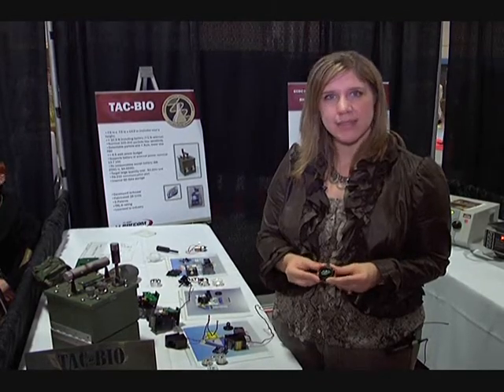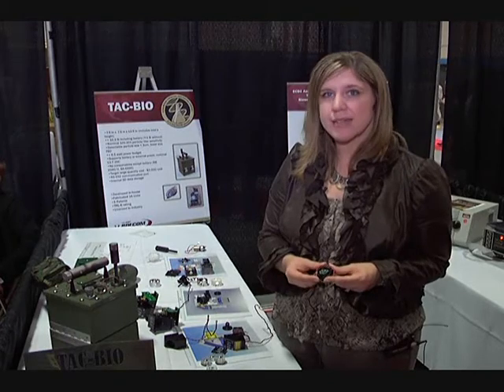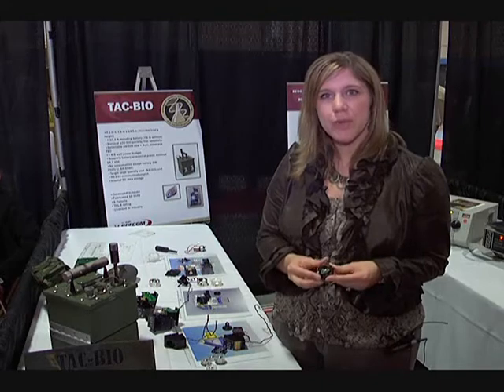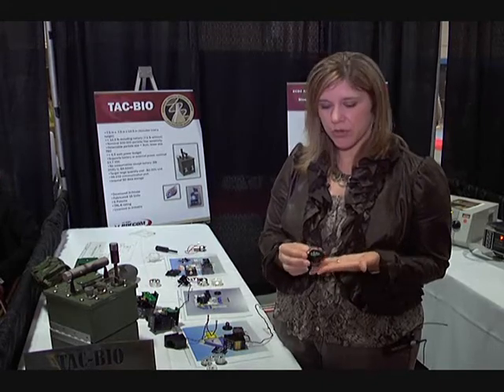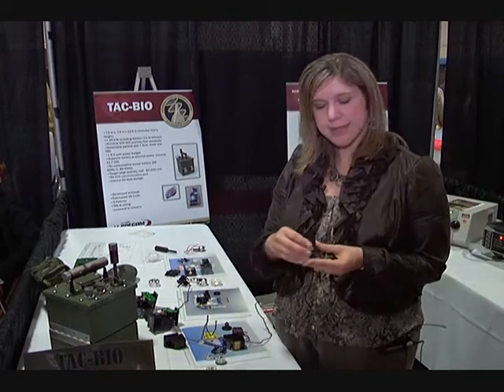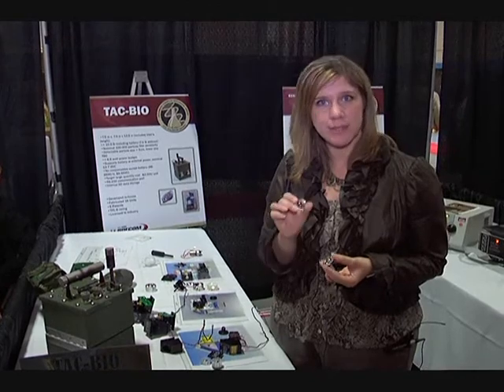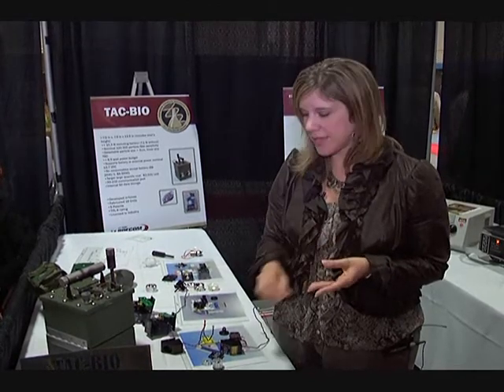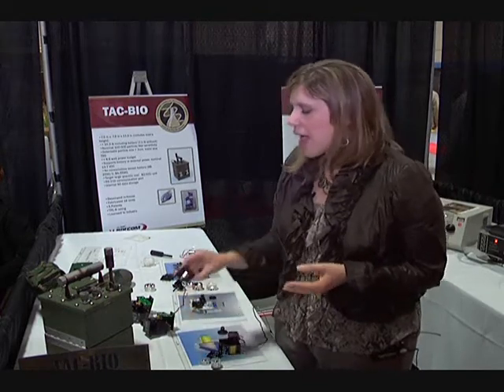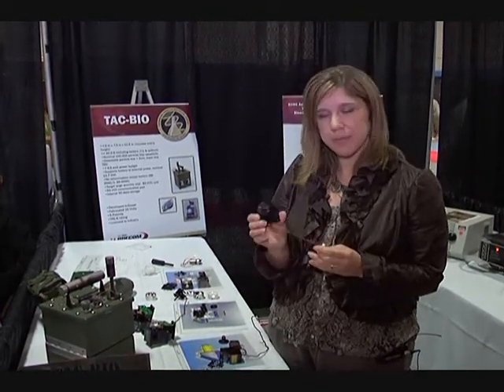So we were tasked to make a biological detector using the UV LEDs and to make it as cheaply as possible. Therefore, we used the UV LEDs and we made lenses that were injection molded. These are plastic parts that are only about $7 to $10 a piece, and we're able to use them to collimate the light from the UV LED, and then filter them through and make a front end assembly such as this.